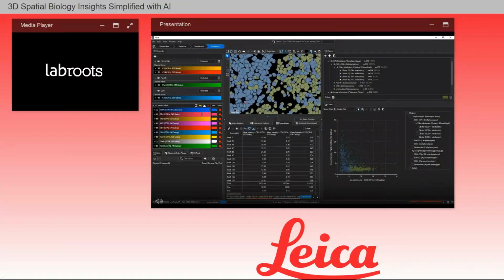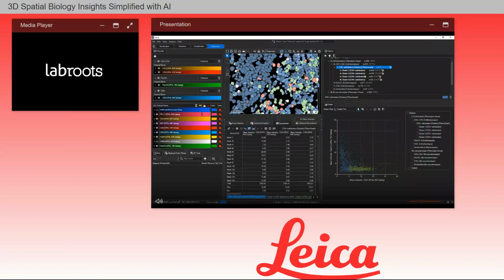Let's go back to my previous subclusters. Now, you may be wondering what these clusters mean. For us to understand these clusters, we will need a different tool to examine them. We will go to Charts again and select Dendrogram.